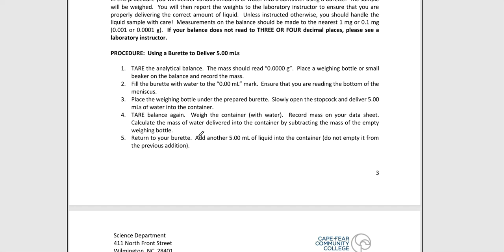Our Excel spreadsheet is going to trigger, yep, actually, great job, greens and blues all over the place, good for you, go on to the next part. Or it's going to say, sorry, you don't do very well with burettes, you need more practice. And then we're going to say, okay, let's see what you're doing, let's see what your procedure's like, where are you messing up, because we need to figure out where these problems are.